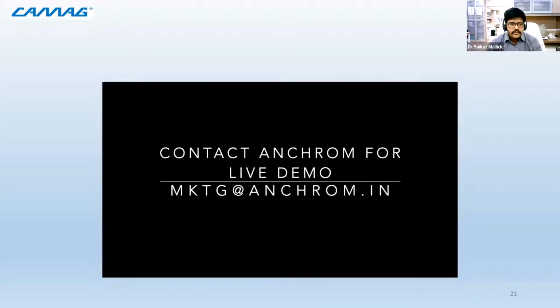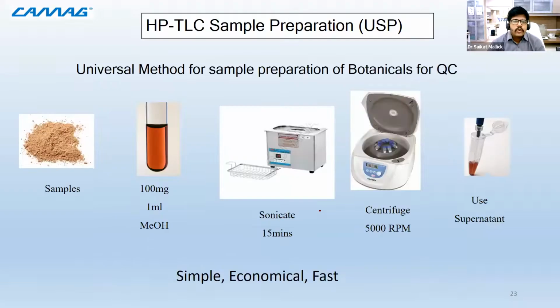Okay, so this was the next generation equipment which is coming in, and here you saw how more control over this chromatography is being achieved. Now when we move further, these are some strategies. This is about sample preparation, an important aspect of doing bioautography studies. As I told you, concentration is an important aspect. At the same time, you need to have the sample preparation simpler.